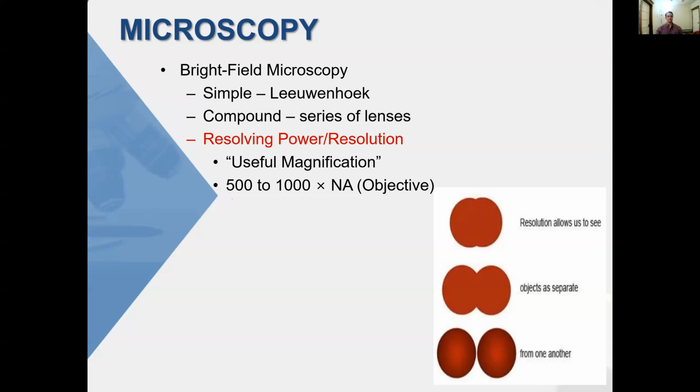There is a minimum magnification necessary for detail present in an image to be resolved, and this value is set rather arbitrarily as 500 times the numerical aperture. And then it's defined by an equation that we will be going into a bit later. So the take-home message is that the range of useful magnification for an objective and eyepiece combination, so the total magnification, is defined by the numerical aperture of the microscope system.